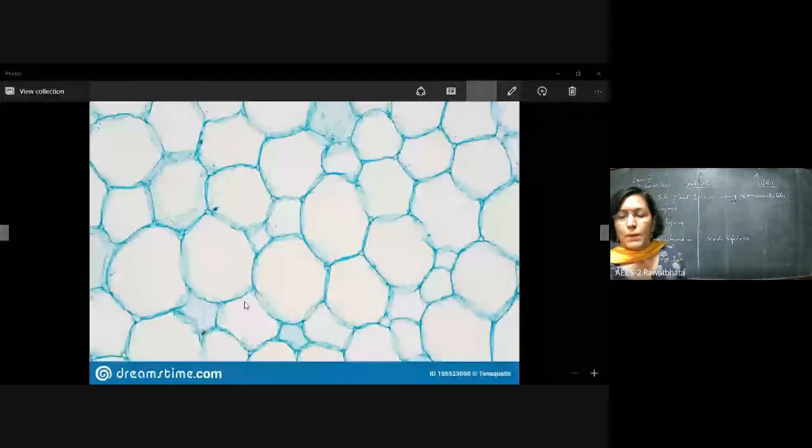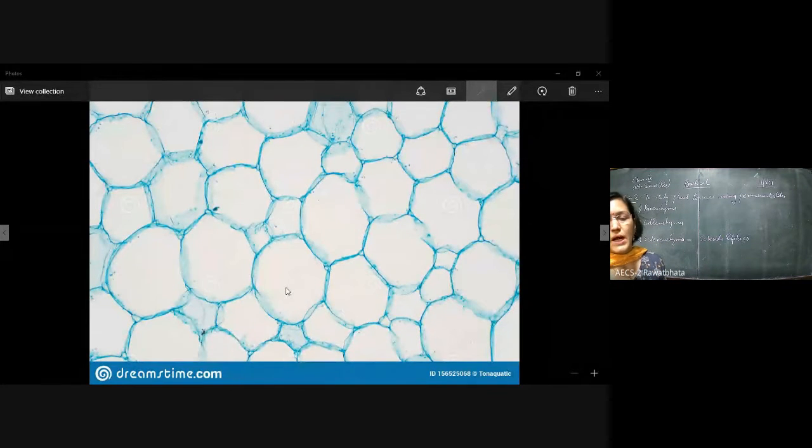This is what parenchyma cells look like under the microscope. Now, if we observe carefully, the parenchyma cells have these thin walls. As the cursor moves all along the length, the whole of the body of the cell, you can say that these are thin-walled cells. And this is how the parenchyma slide will appear to us, almost similar to the diagram that we have seen.